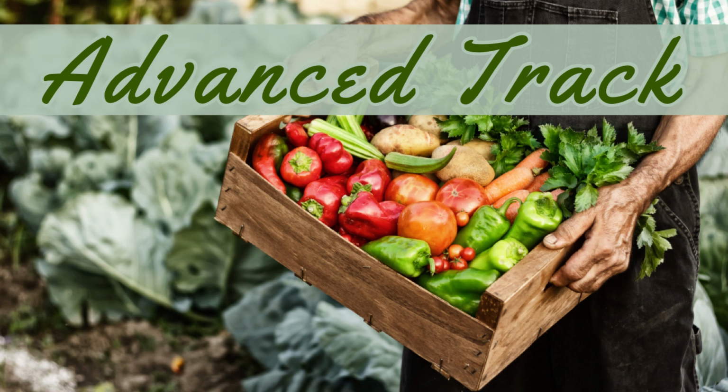Well, hi. Did you see this? You know, I am, actually. Thank you. Thank you for clarifying. At this point, I don't care who goes first or who goes next. Take a few minutes. Everybody has an opportunity to utilize this tool. The fine focus knob, larger focus, etch a sketch. Up, down, side, side. Make sense? Who's next?